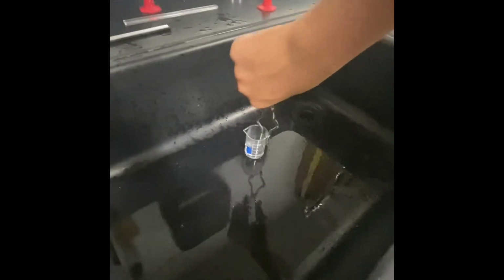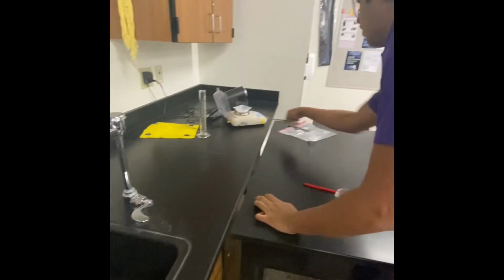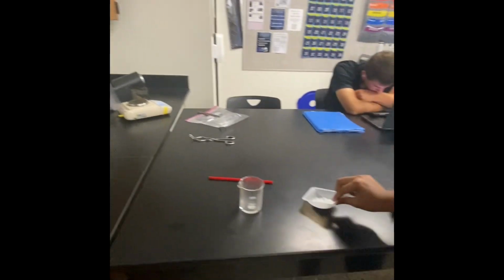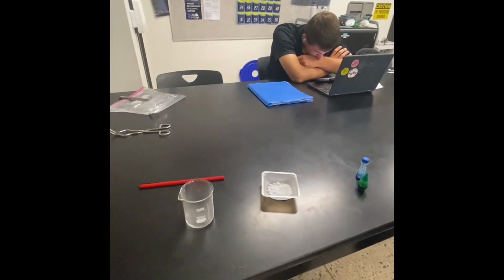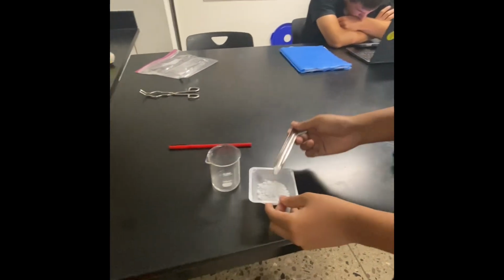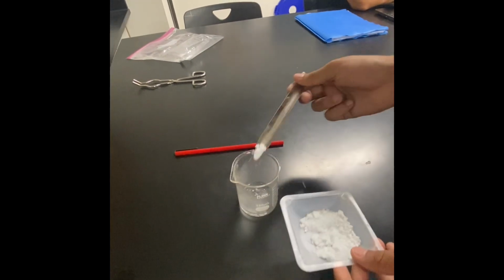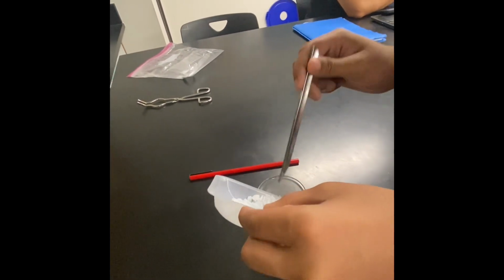This is hot. We want to move it into a bigger beaker so we can mix the alum powder. So we're going to take this beaker and pour. Put it right back here so it can cool down. We're going to take our 10 grams of alum powder that we measured out, and make sure our safety goggles are still on. We're going to gradually add the alum powder while mixing, and keep doing that. We can go a little faster as we just keep pouring and mixing.